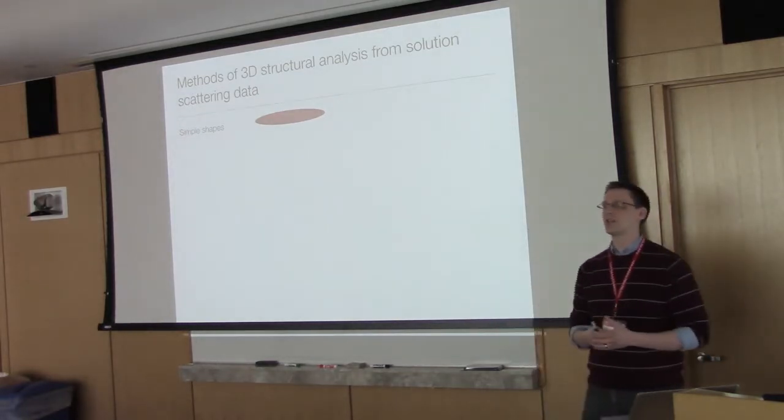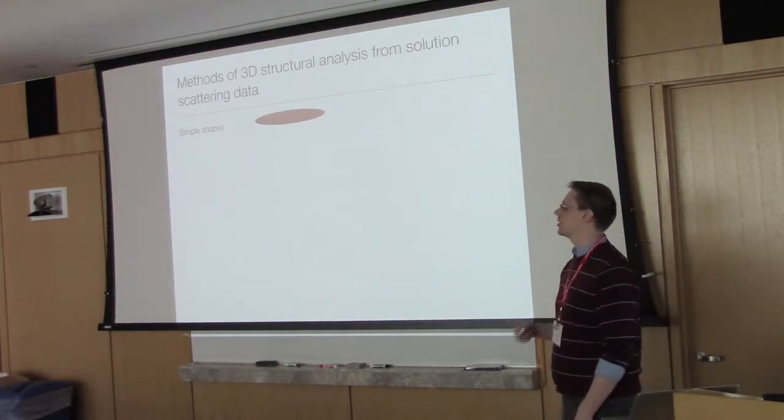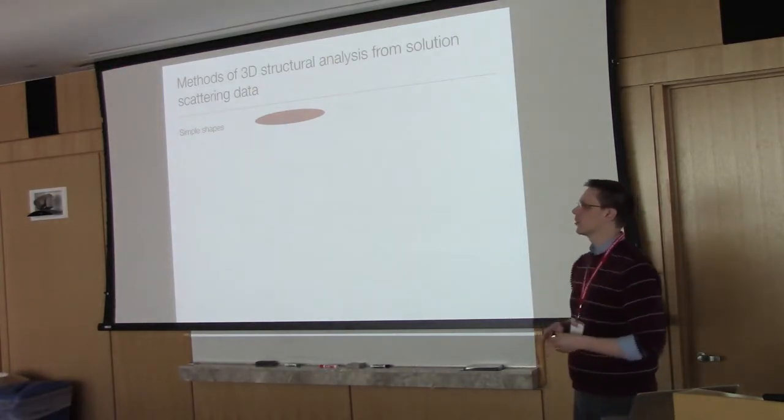Pretty much all of the ways that we get three-dimensional structural information from solution scattering is through modeling. And this has developed historically over the last few decades in different ways. So it was first by doing simple shapes.